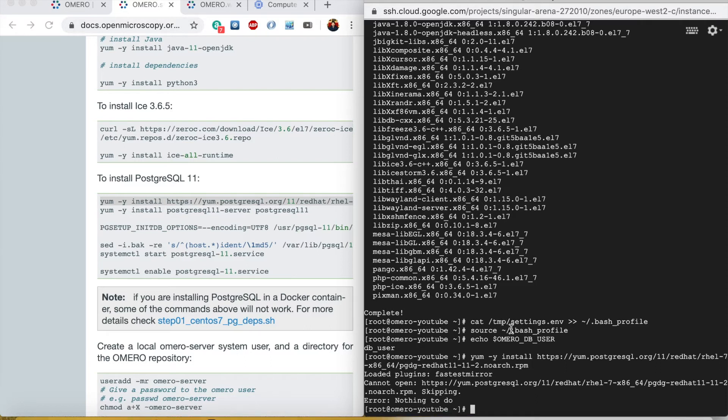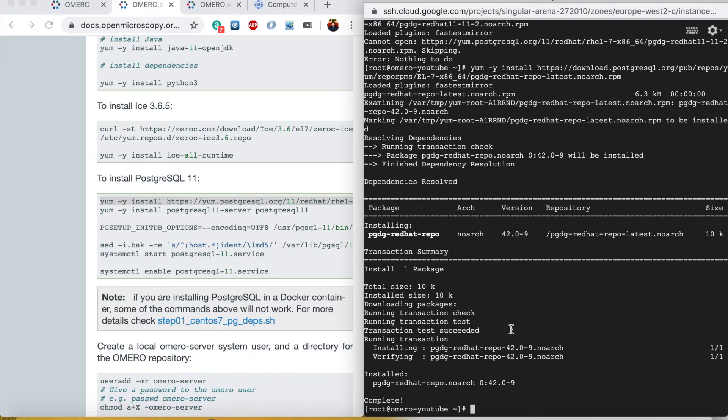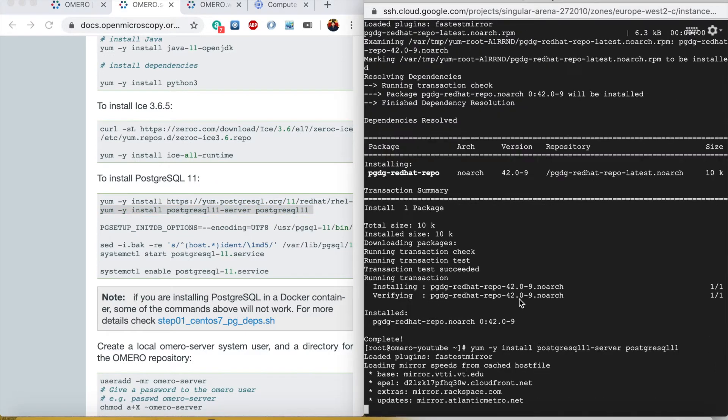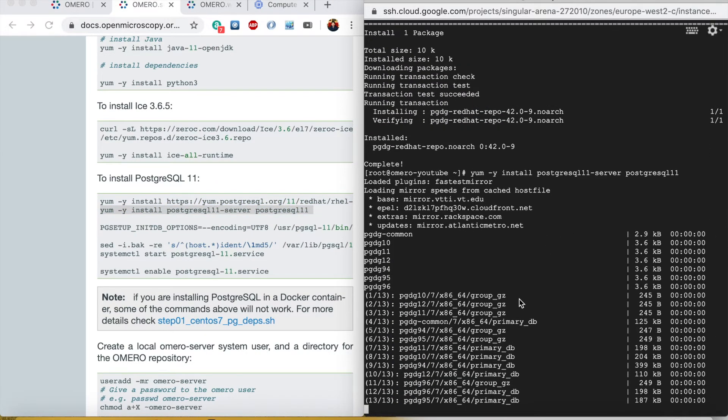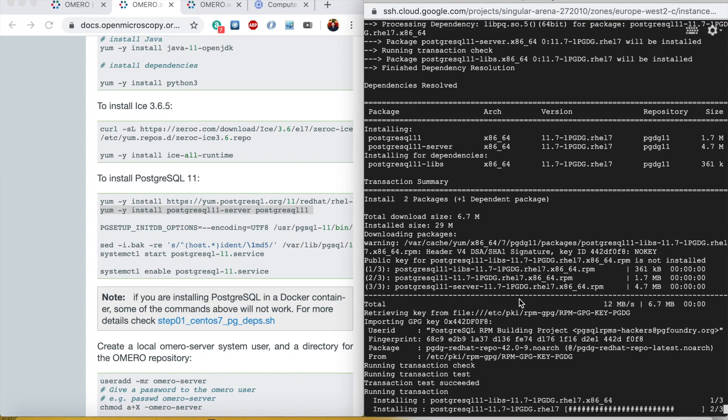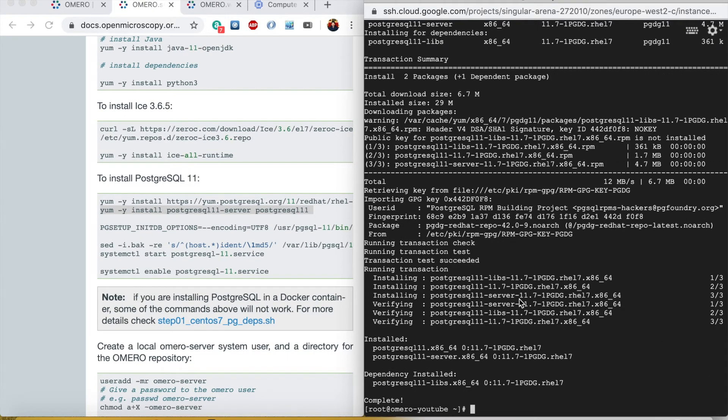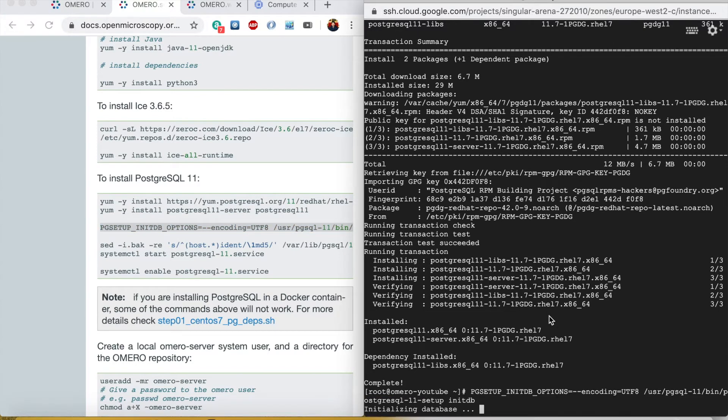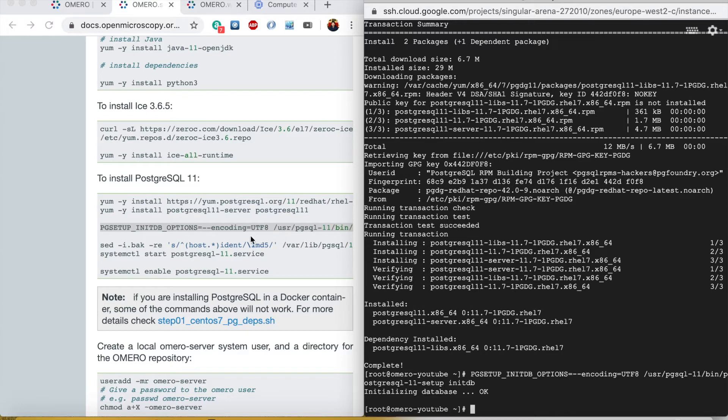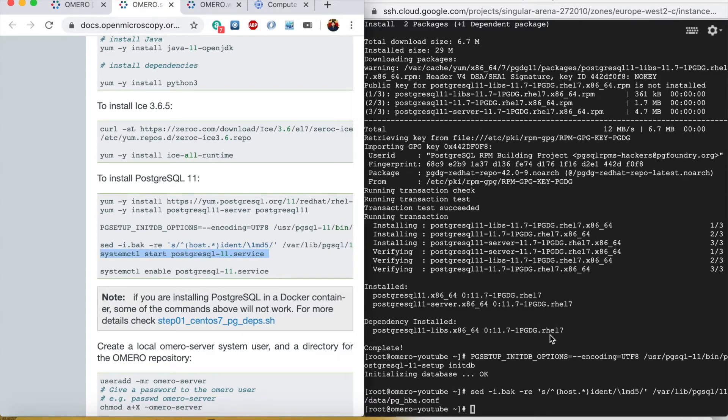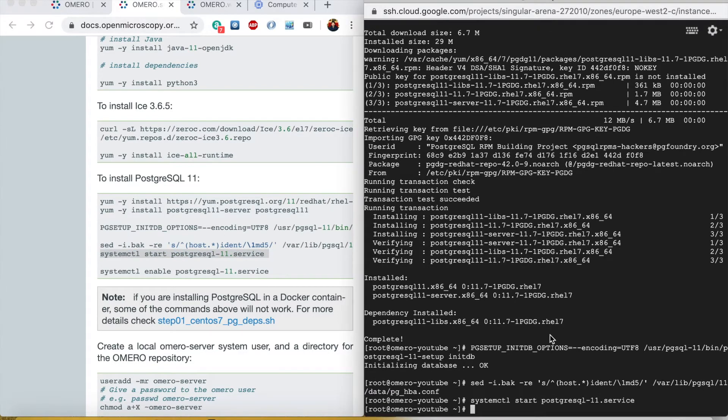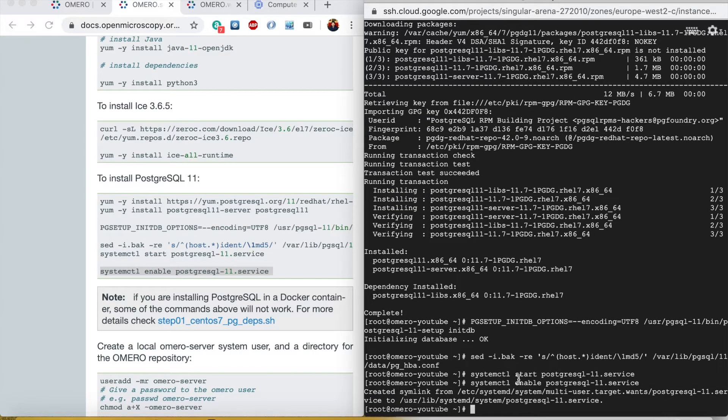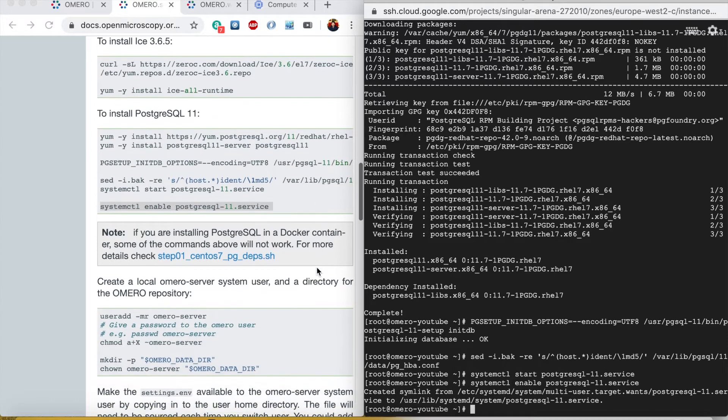That one worked and now we will continue with these commands. This will start PostgreSQL server and this will enable PostgreSQL server so that it starts on the next boot.